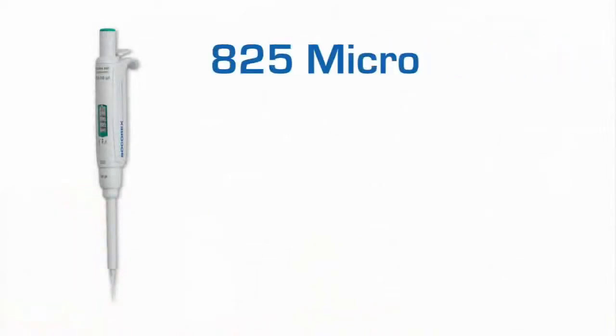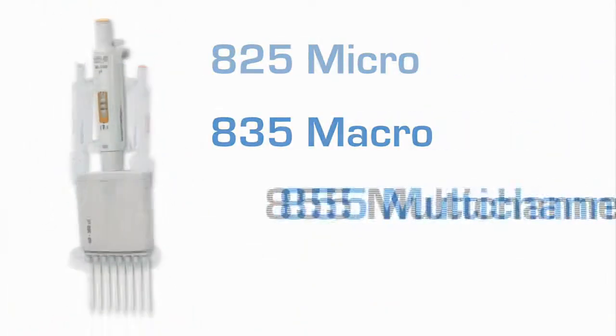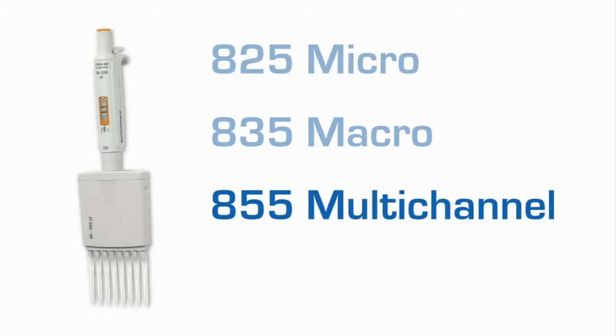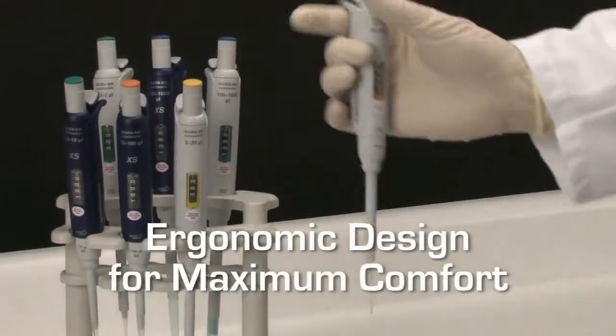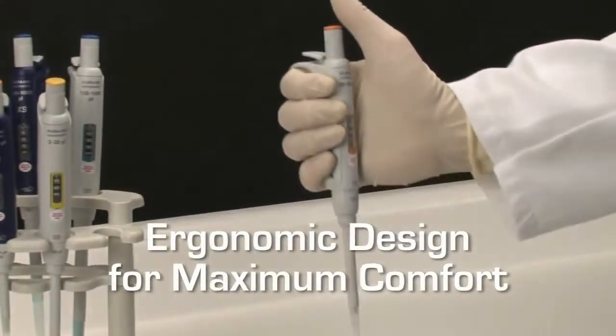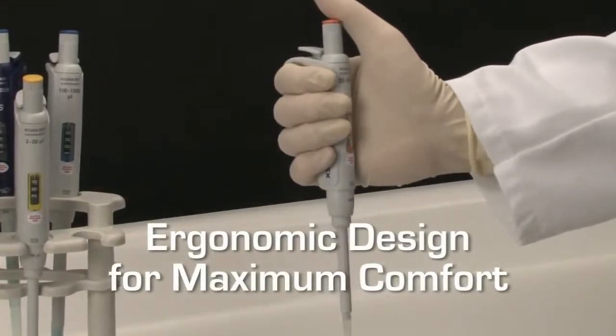Available in the well-known 825 micro, 835 macro and 855 multi-channel models and introducing the new 826 XS model for enhanced performance and research applications, Acura Manual Pipettes are designed and engineered to be comfortable and user-friendly as well as easy to maintain.